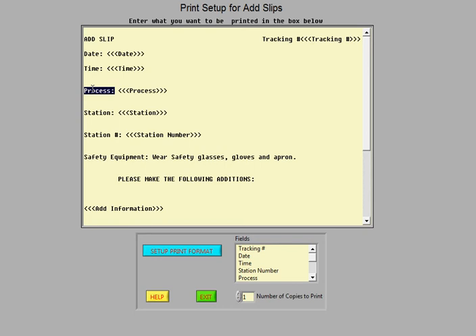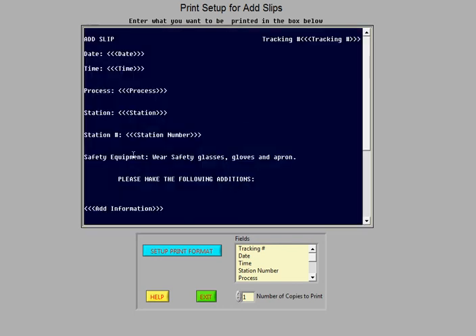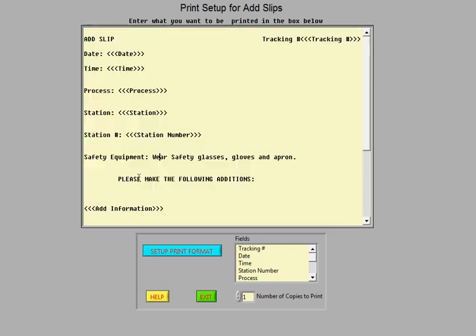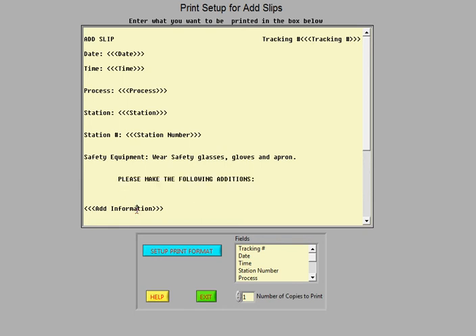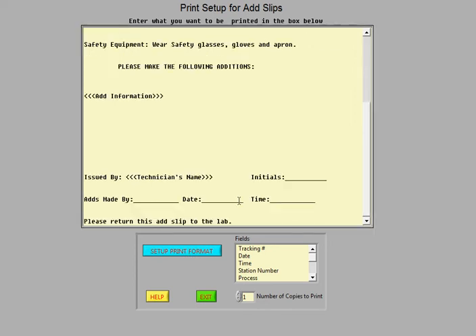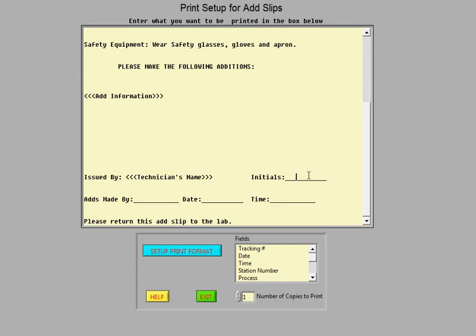So that shows up on the upper right hand, the date, the time, the process, the station, station number, safety equipment to wear. And here you have this comment that you type in. And then there's an add information. And below that, you have issued by the technician's name who happens to be logged in. In this case, it was Ron. And the technician in this case would put their initials right here.